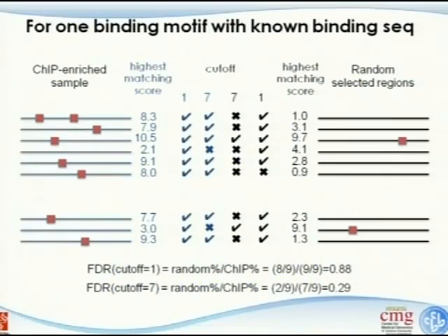And we know that in the promoter regions, there are a lot of CpG islands, meaning those promoter regions are CG enriched. So if I'm comparing the ChIP-identified region versus a random genomic region, I end up selecting the differences, which potentially are the difference between the promoter region and the random region. It's not really anything to do with the ChIP experiment I did.